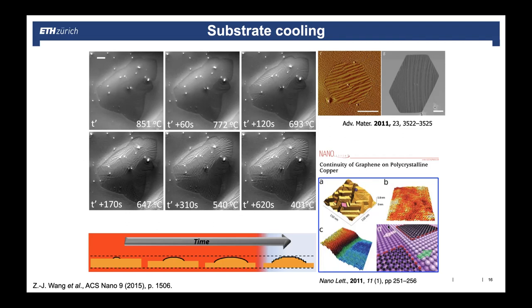But why do they form? What is going on here? Now, meanwhile, we know much more than we knew then, and I can tell you these are oxygen-induced surface reconstructions. The point is, when we grow graphene, we grow it in the chamber, and the oxygen partial pressure is never zero. It's an SEM that has rubber seals, it's not a UHV chamber. And actually, I heard people say that in a UHV chamber, that is really perfect vacuum, with just ethylene and hydrogen, you cannot grow graphene.